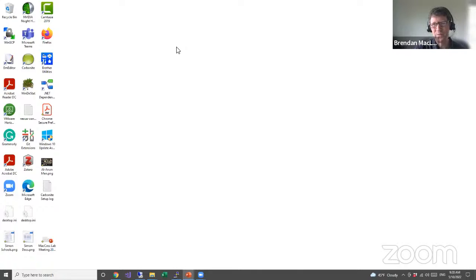But we used a 5-minute retention time window, and that turned out to be too small, even with the low variability in retention time. There was a lot of truncation where we lost information, which Lindsay showed yesterday as well. So I don't know whether Deanna is still typing an answer to that one. Maybe not. I will say that it's answered live.